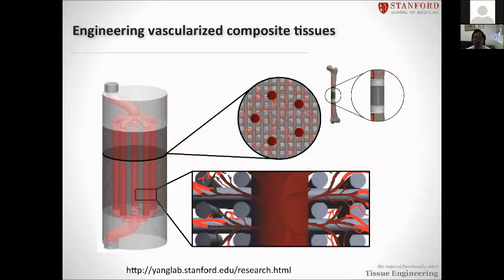So in our lab, what are we trying to do? We try to combine the large blood vessel and the capillary together. From this schematic, we can see three components. The first component is rigid, a polymer or composite. This will provide structural guidance, structural integrity, and mechanical support. And here is the major vessel. The major vessel is made of cell with hydrogel. And between them you have a lot of porous structure. This is the capillary. The capillary is the third component.